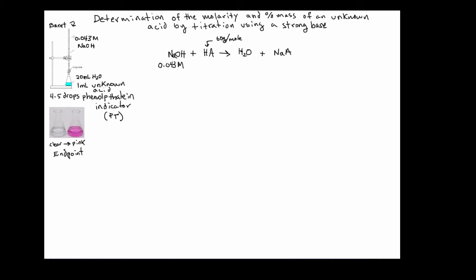And we have that established in the burette, which I'm showing schematically over here on the left side of the screen. So remember, your burette is a graduated cylinder with a valve at the bottom of it, which is called a stopcock. Usually in a teaching lab, the burettes are going to hold a maximum of 50 milliliters. So we can control how much solution we let out of the burette by manipulating the valve. And at the end of the experiment, therefore, we can know precisely how many milliliters of the NaOH solution were utilized to get to the equivalence point.